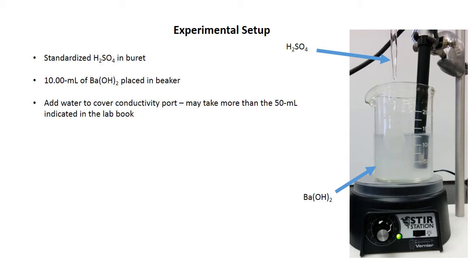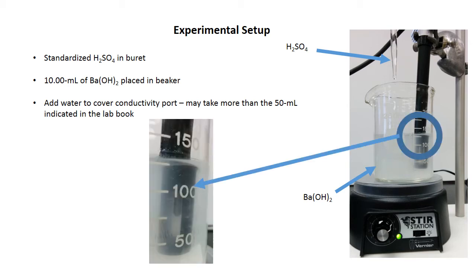This is the conductivity probe in here. Looking at a closeup of the tip, down here you see the tip of the conductivity probe. You want to make sure it's in the solution. In the lab book it said 50 milliliters of water. You notice I'm well over 100 here. We don't really care how much water you add. All we care about is that you get over the top of that opening in the conductivity probe.